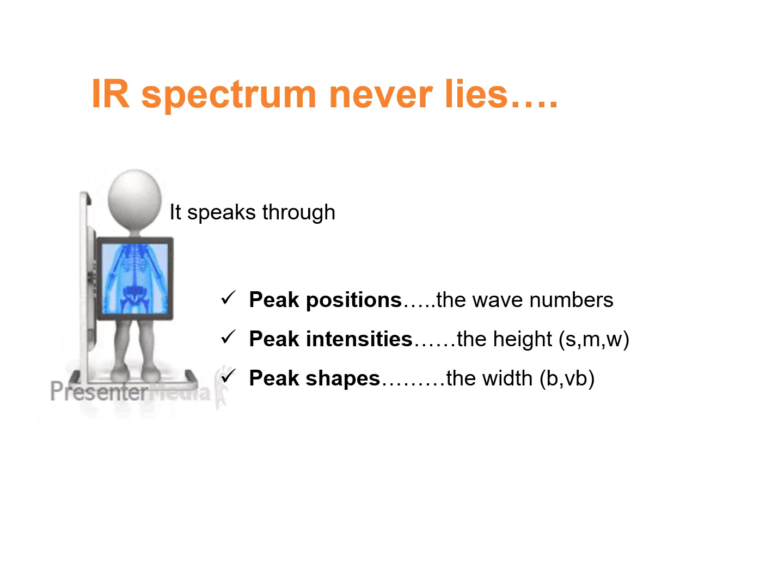complete structure. IR spectrum is like identification of a compound, and spectrum doesn't only mean the numbers which students keep on by hearting, but there is a lot about where these peaks appear, at which wave numbers, what are their intensities, whether the peaks are strong, medium, weak, how are their shapes, whether they are broad, very broad, or whether they are sharp.